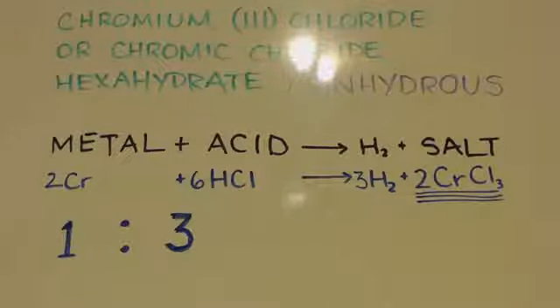Well, 22.4 liters is how much 1 mole of gas takes up. Now, that's at STP, standard temperature and pressure, 14.7 psi, 0 degrees Celsius, and that's an ideal gas. Keep in mind, you multiply that by 1.5, and you would get 33.6 liters of hydrogen gas you're producing. And if you're American, that's about 8 gallons. I'm just guessing, but it's give or take. But it is 33.6 liters. So that's just to let you know.